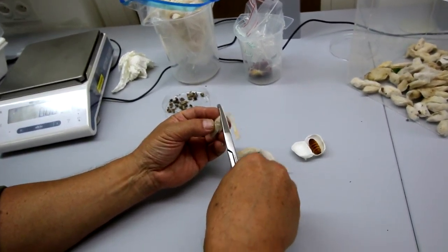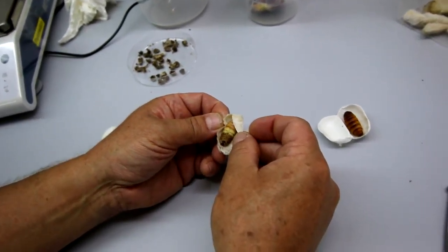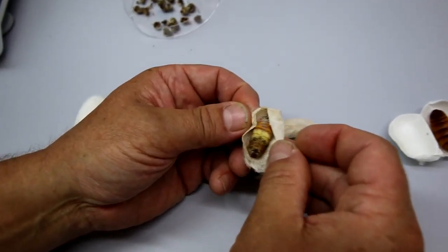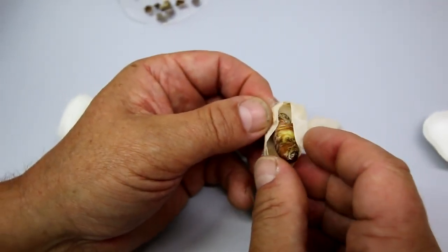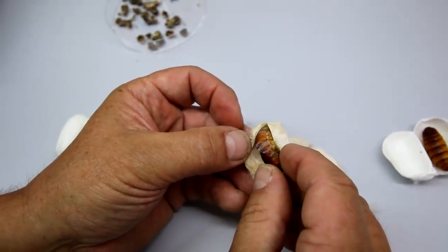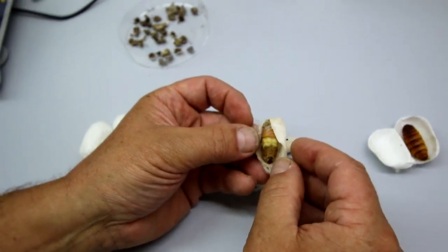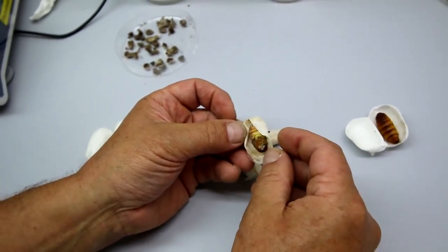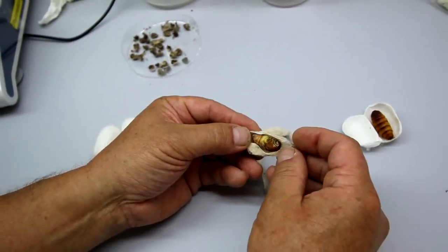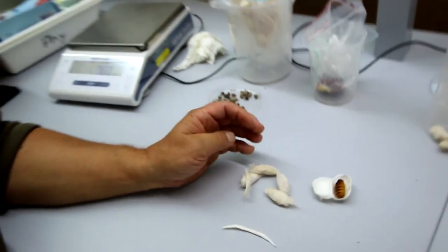What we see here is an unfinished pupa — it's still in the stage of a larva and didn't reach the pupa stage yet. I think this one won't make it anyway, because sometimes they have problems coming out of the larval skin. So I wouldn't use this one as a sample.